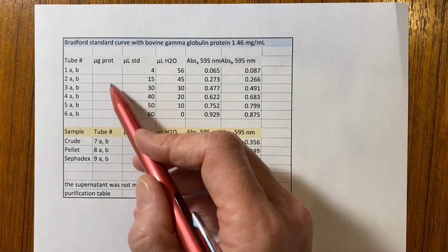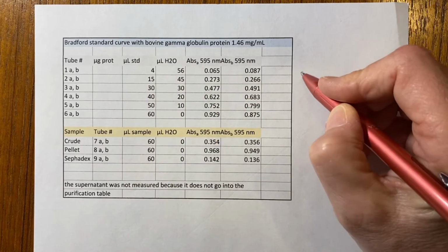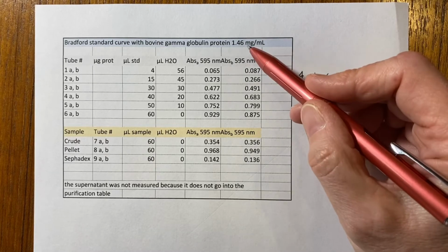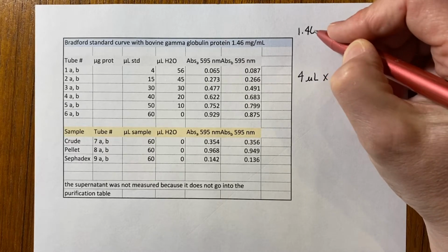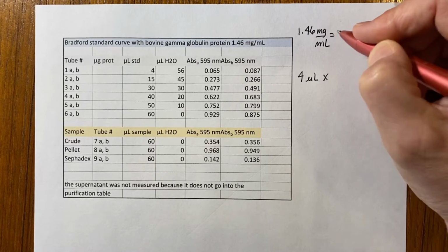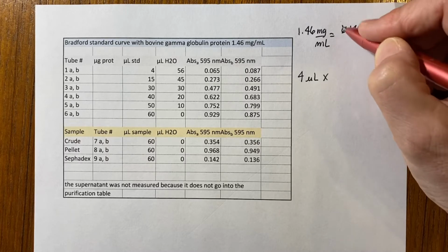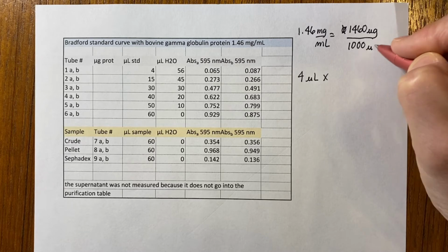So in order to calculate these in micrograms, you would take the volume that you used, so we'll do the first one, 4 microliters, and times it by the concentration of the standard protein, which is 1.46 milligrams per mL. So that will equal 1460 micrograms per 1,000 microliters.